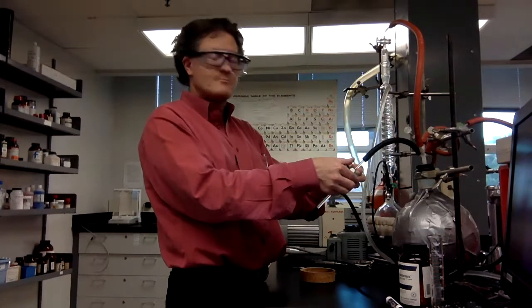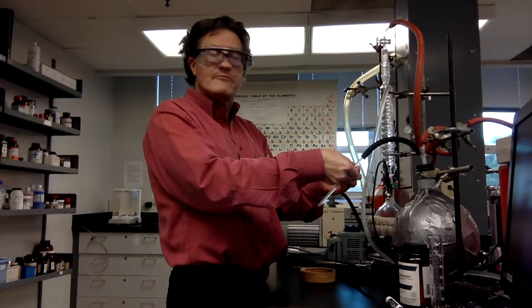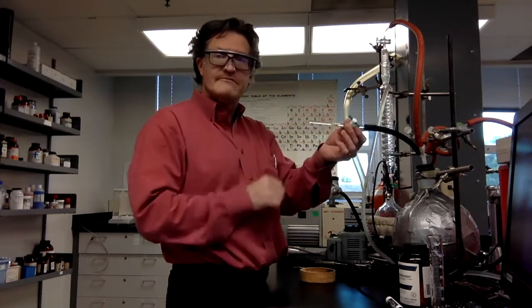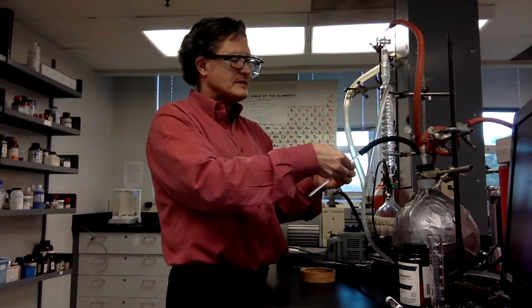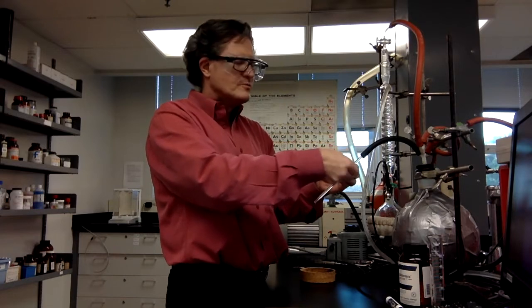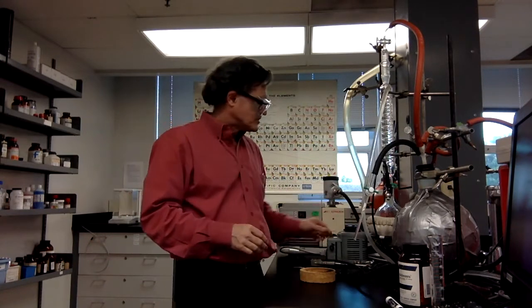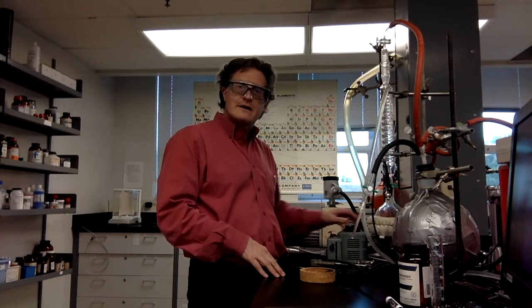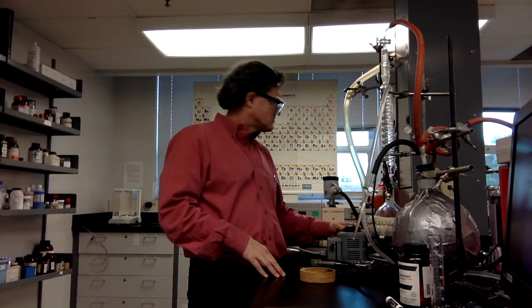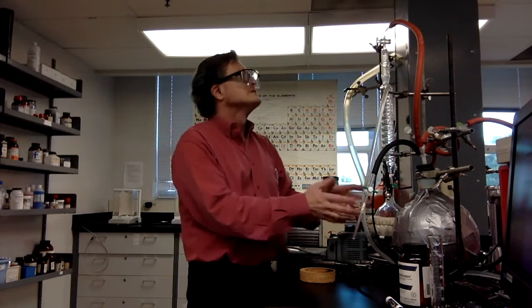We can adjust the pressure by allowing a little bit of gas in through here. This is the vent valve again. The easy one, no backlash on this one. Let some gas in, get it to about 20 kilopascal, so a little bit lower than that. And then what we're going to do is turn on the variac, heat it up to about 20, 25, actually probably a little bit higher. And then we want to start boiling.